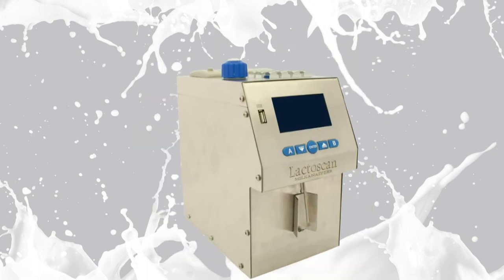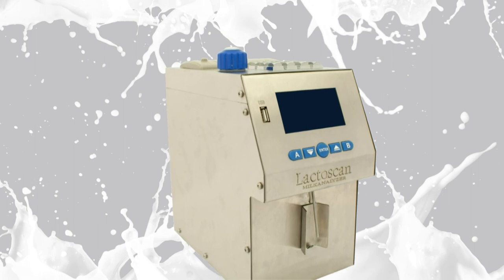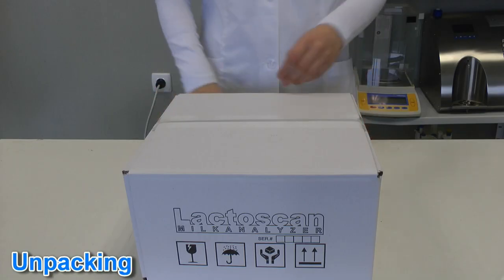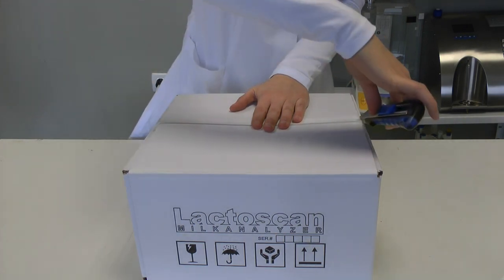This device is making rapid analysis of any type of liquid milk, cream, and wheat.